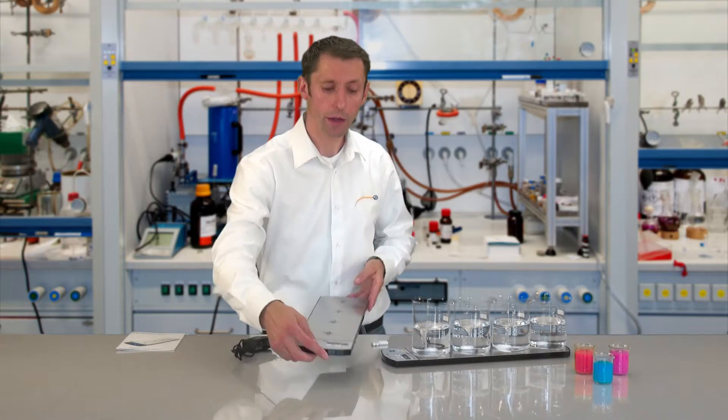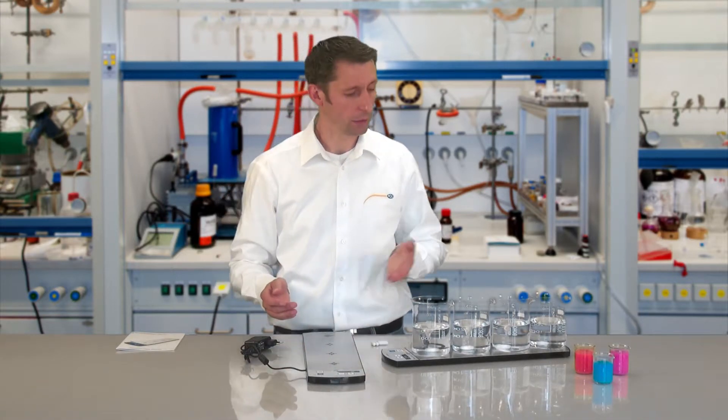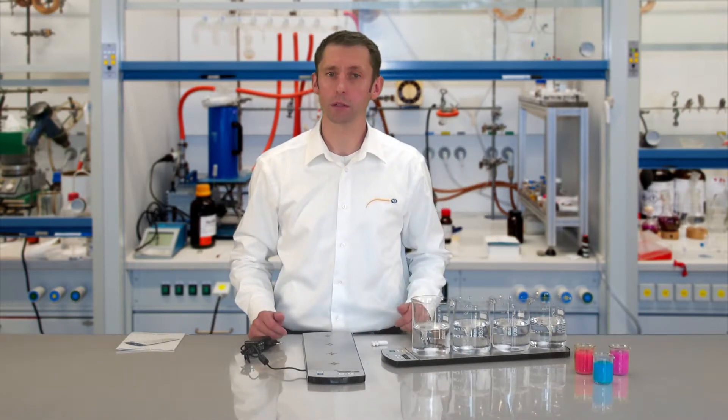Through this we reach a dust and water proof rating of IP65. The stirring volume of every single stirring field is maximal 400 milliliters.